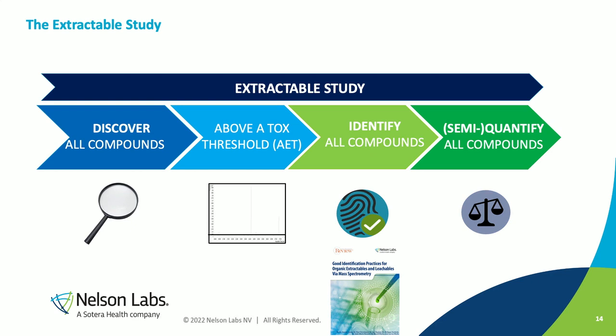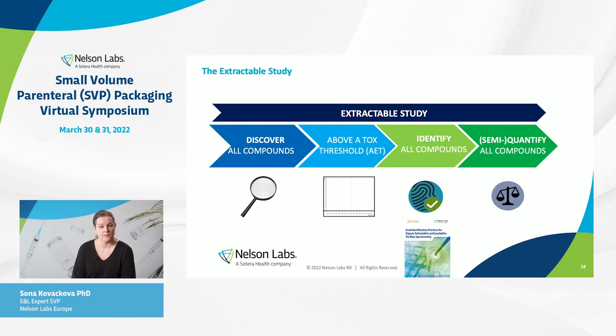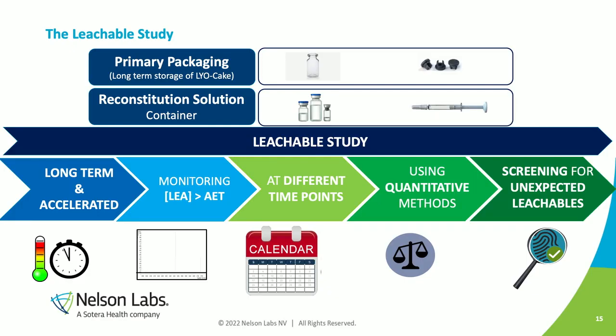On this slide, you see the typical setup and workflow for an extractables study. This was discussed earlier in the day by Denis Janke, who focused on the individual steps of the extractables study. The extractables study on the lyophilized drug product, or on the packaging for a lyophilized drug product, does not differ much from an extractables study on any other liquid parenteral drug product. The same is true for the leachables study. What you might want to consider for lyophilized drug product is to add the reconstitution solution to the setup of the study.